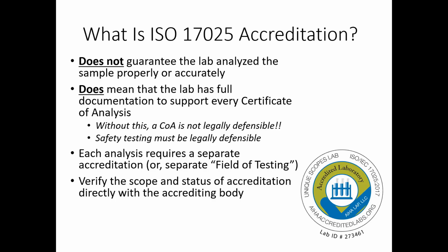But on the lab side, we track every standard that we bought, every solvent, what was used to mix together to make our calibration standards, all of our quality controls for every batch that go with your samples. All of that is very thoroughly documented and has criteria that it has to fit within. And that's really what you get with ISO, this legal defensibility. It doesn't say that we did it right.